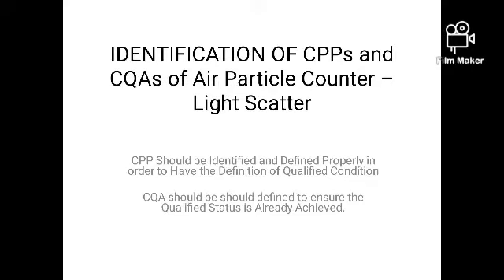Now, let's start to identify the CPP and CQA. CPP should be identified and defined properly in order to have the definition of the qualified condition. And CQA needs to be defined to ensure that the qualified status is achieved and the conclusion can be trusted.